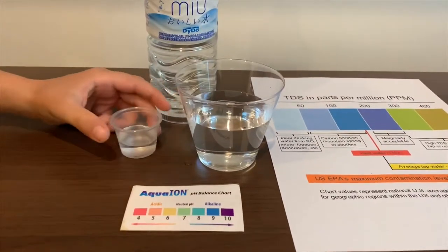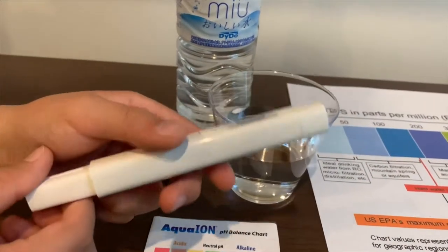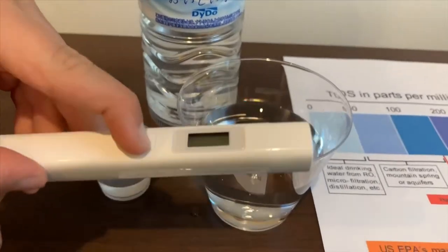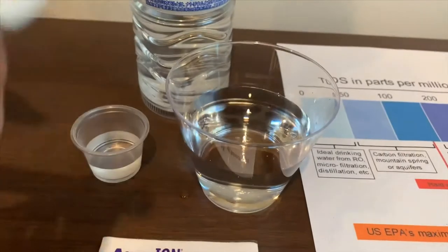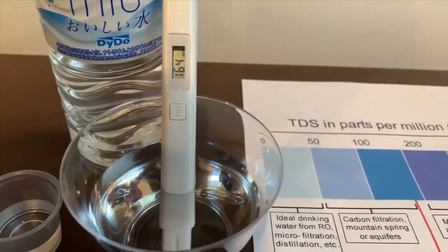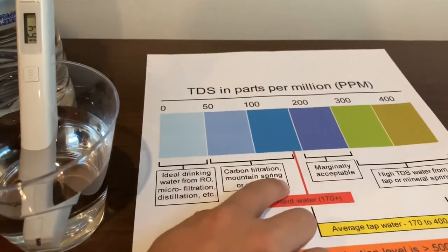First we're going to test the TDS level. If you want to buy this TDS tester, check the link down below. Turn on the TDS tester, make sure it says zero, and put it in. 164 — that is okay to drink.